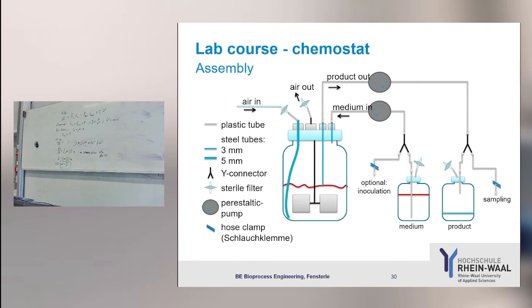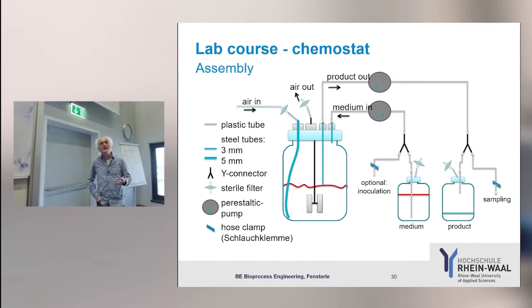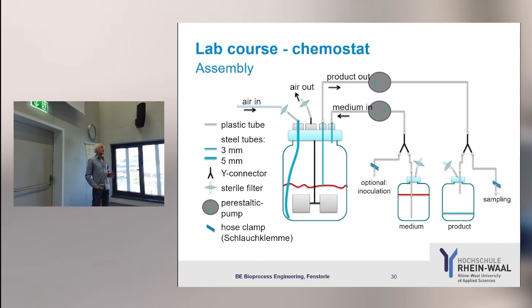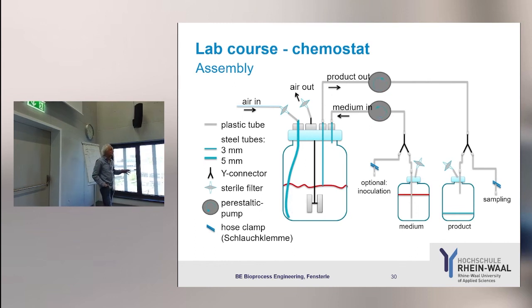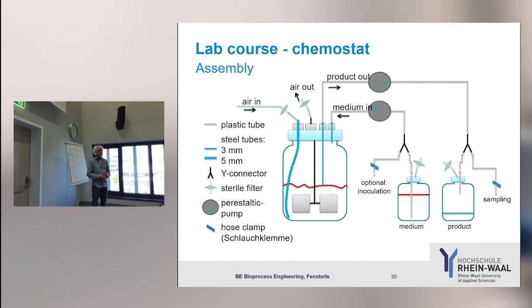It's just important that you get an idea how the setting looks, and there is an additional video on how to assemble that. Watch these videos, because one intention of this experiment is that there is a lot of tubing. You will see that there are tons of tubes around, tons of pumps around, and you have to learn how to work sterile in such a setting.